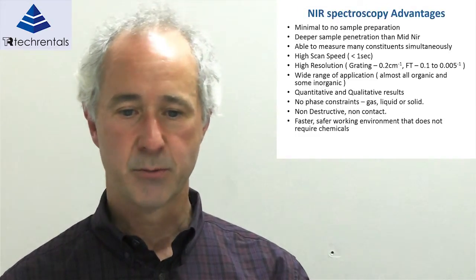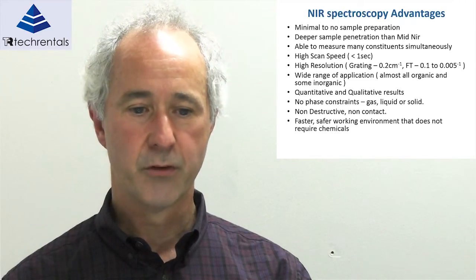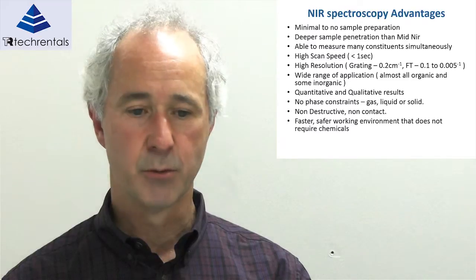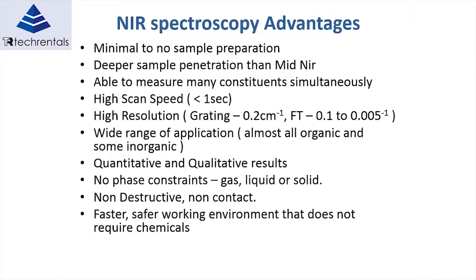So, near infrared spectroscopy advantages. Again, we'll just cover a few more of these. There's minimal to no sample preparation. We have deeper sample penetration than mid-NIR, especially for high moisture product. You can get high scan speeds, down to less than a second, which is very important for inline use.